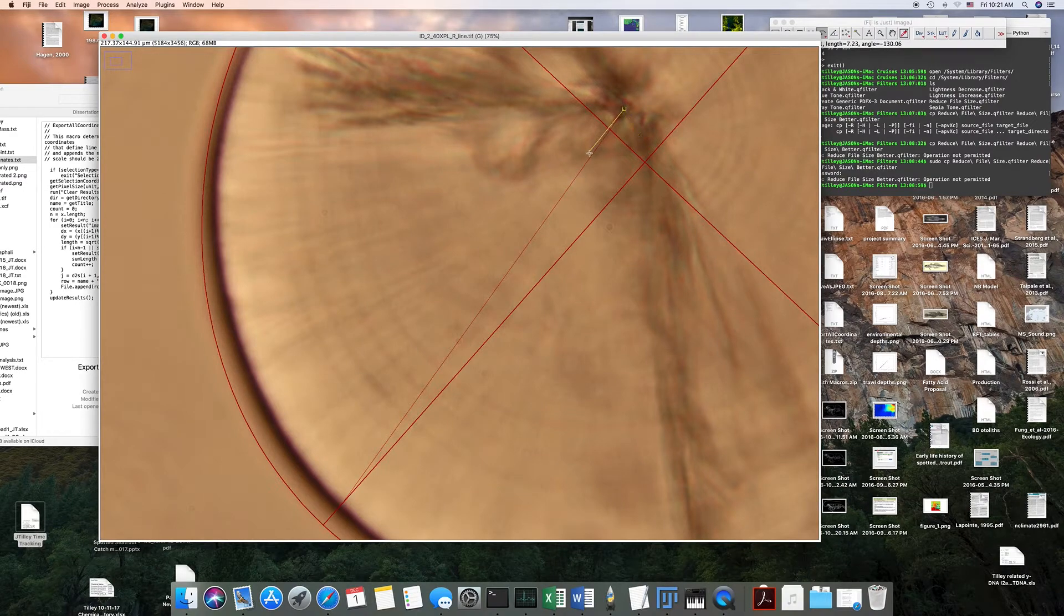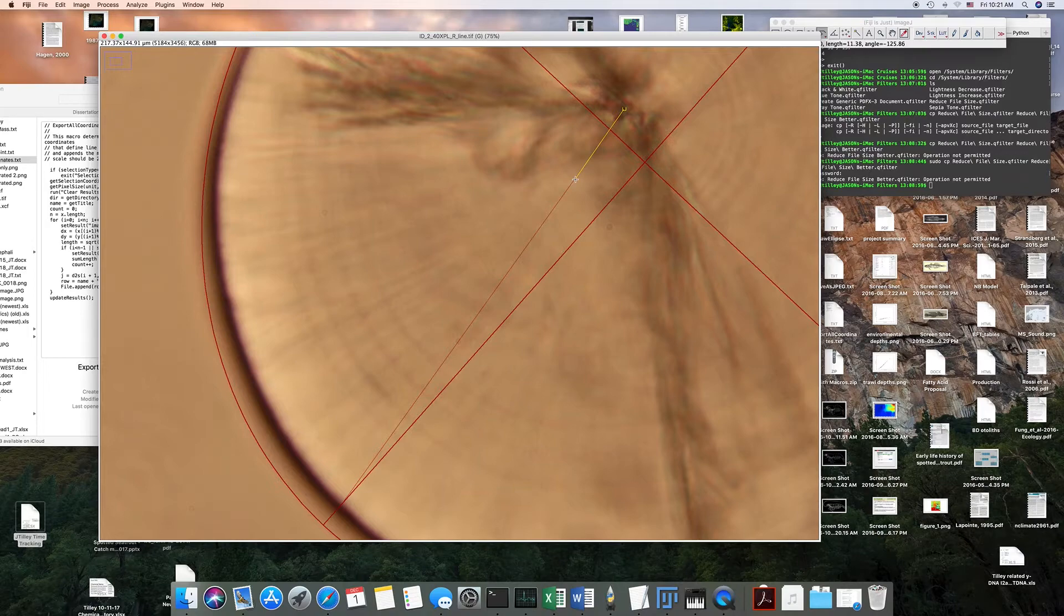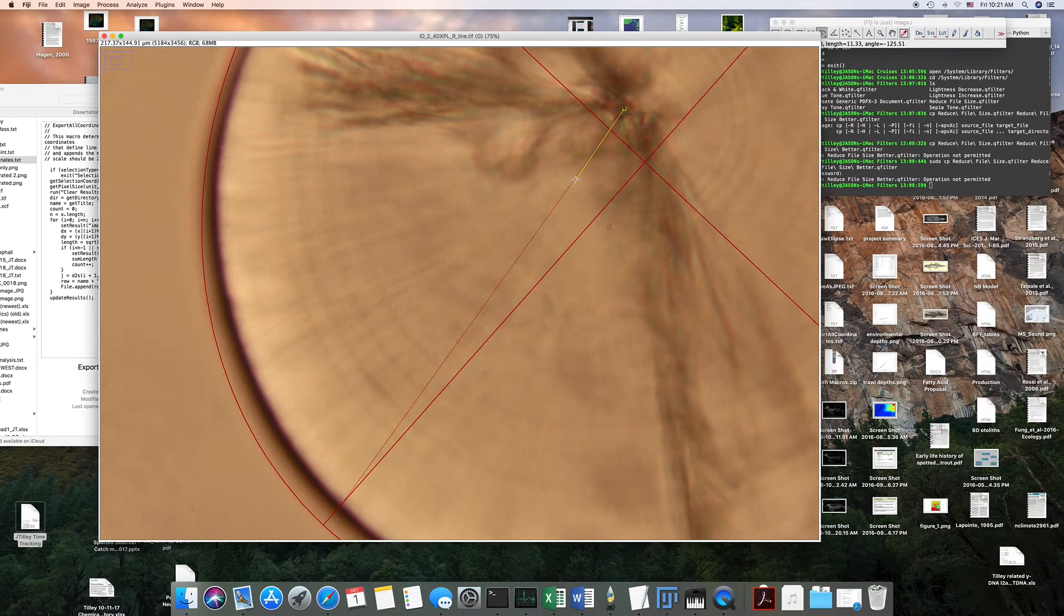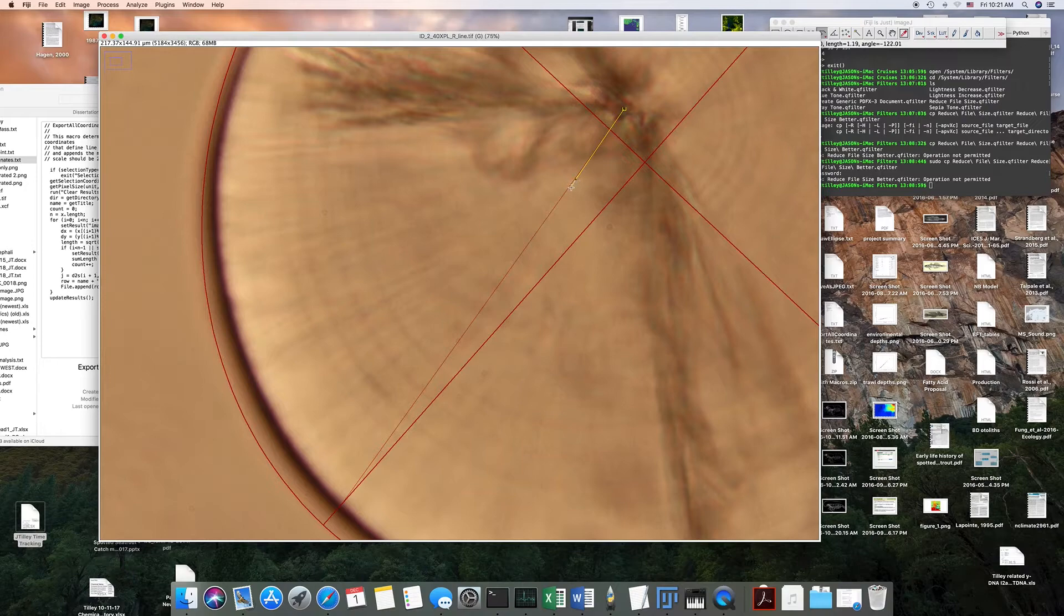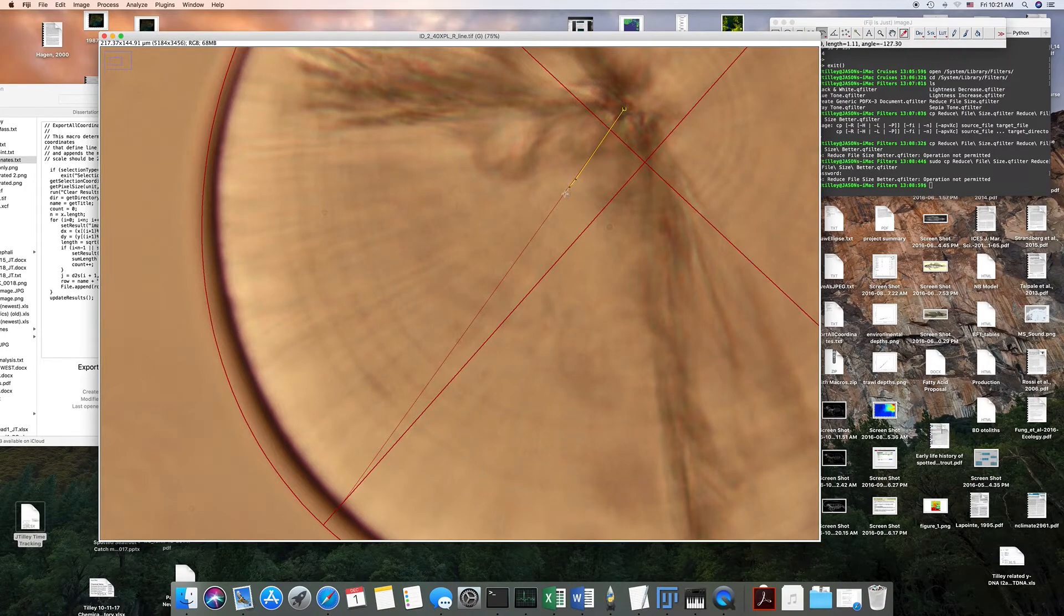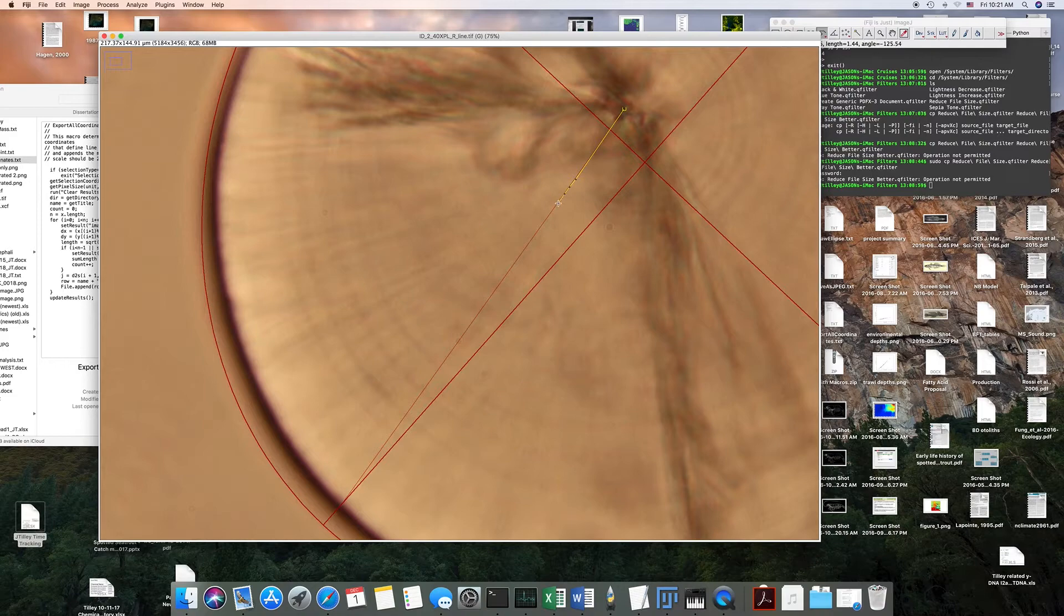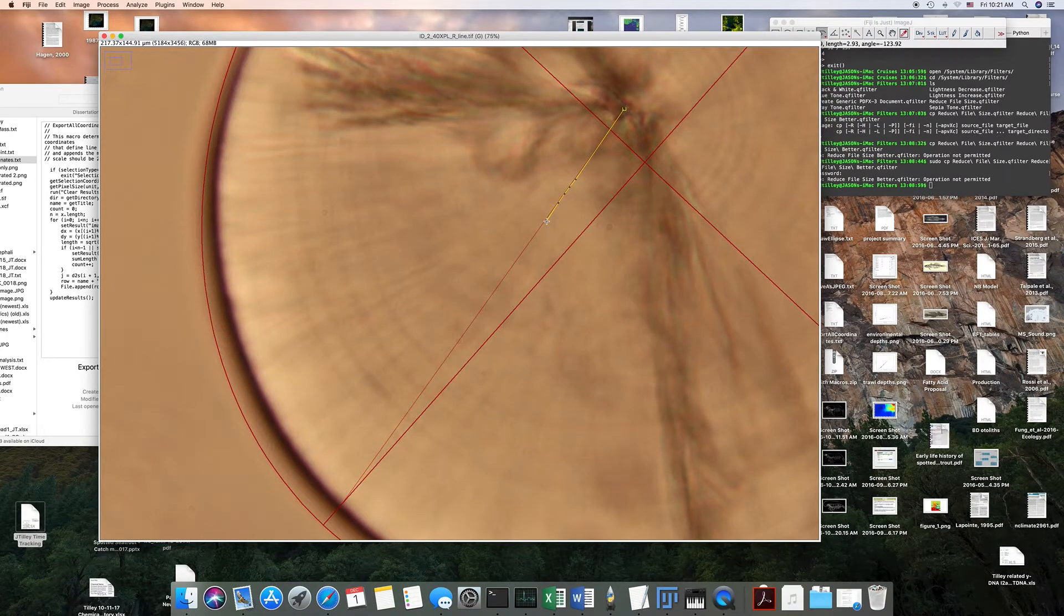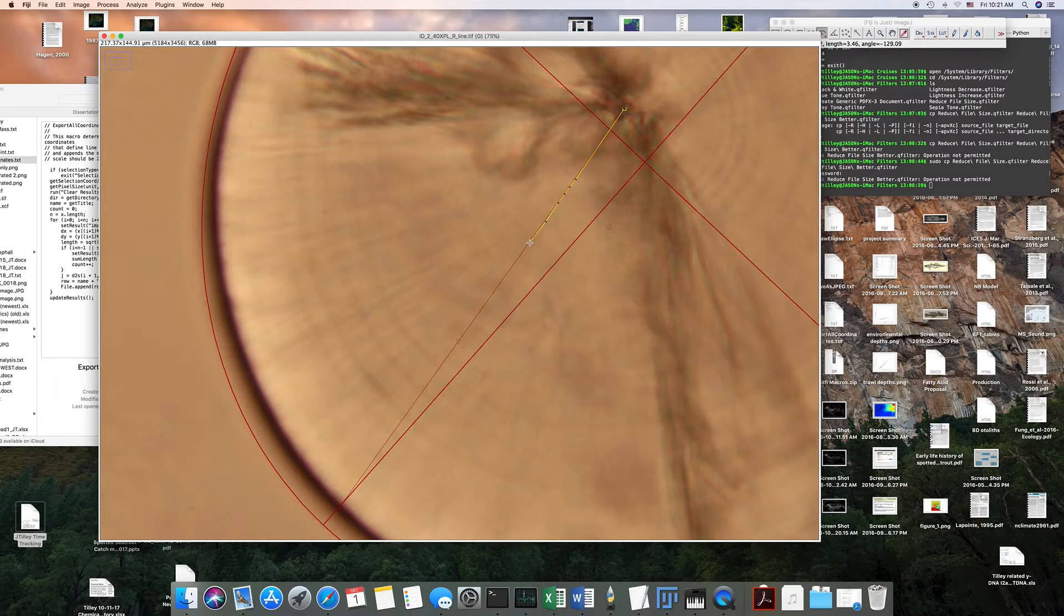To do a segmented line, I might say that's the primordium. This is definitely not a great image, so I'm just going to kind of breeze through this because I'm sure whatever it is, it's not right. But kind of seeing one here, and so you just click each time you see one.